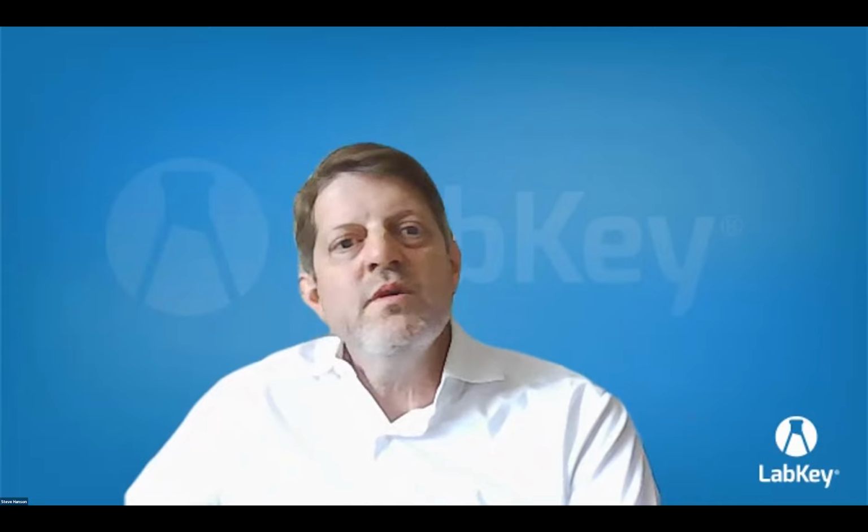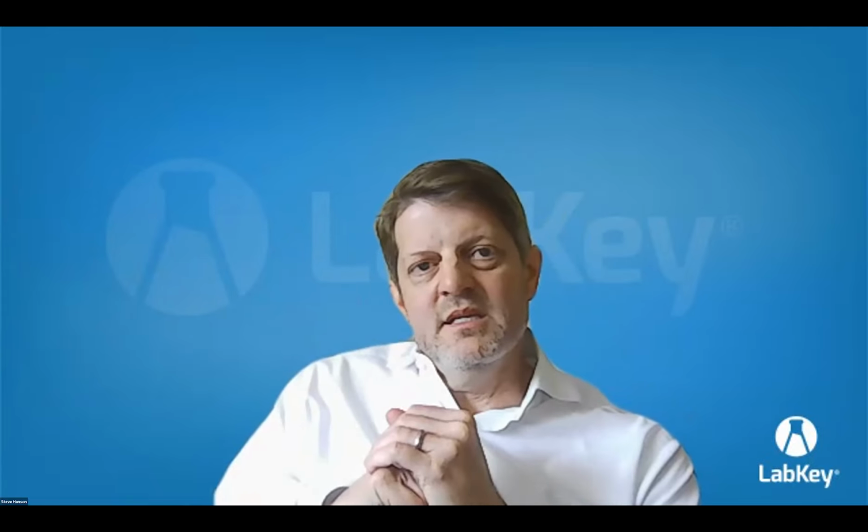Okay. Do you recommend writing queries directly or loading them as part of modules? Well, actually, I recommend starting out with the server UI for building queries. It's easy to graduate and promote your queries into a module once you've got them going. Especially if you're new, just use the server UI. It's easy to fail. It's easy to iterate. There's no need to start with a module. The iteration is more complex with a module. Getting up and running is not trivial.